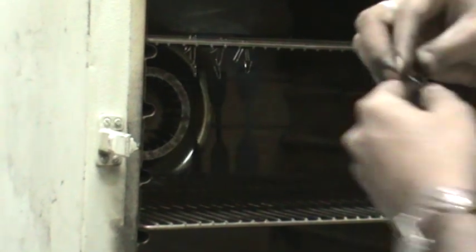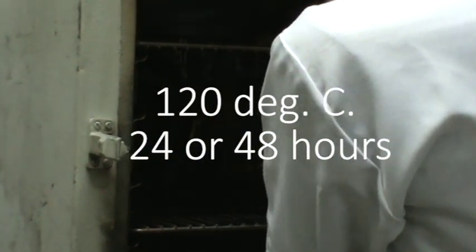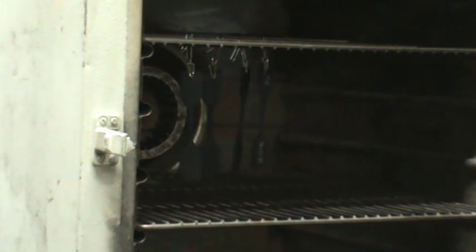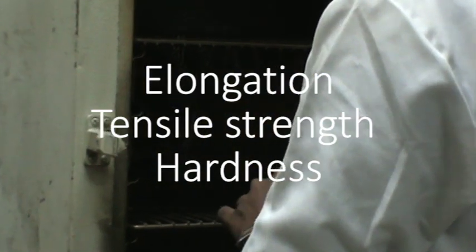F. Aging test. The speed at which a rubber ages is determined by subjecting some samples to a heating oven at 120 degrees Celsius for periods of 24 or 48 hours. The test can measure the changes in physical properties of elongation, tensile strength and hardness of the rubber from the beginning and the end of the test.